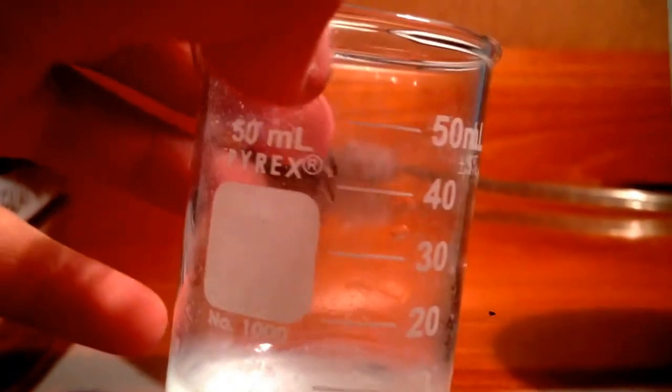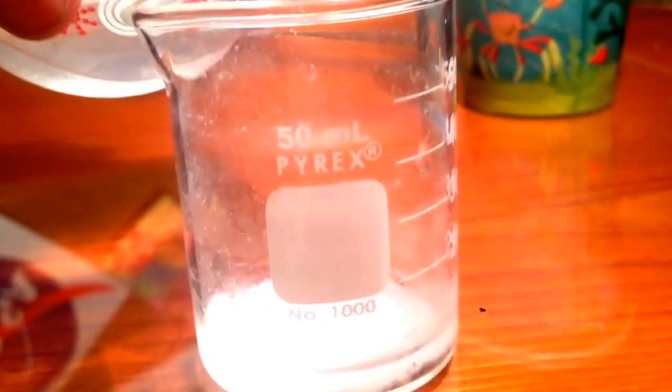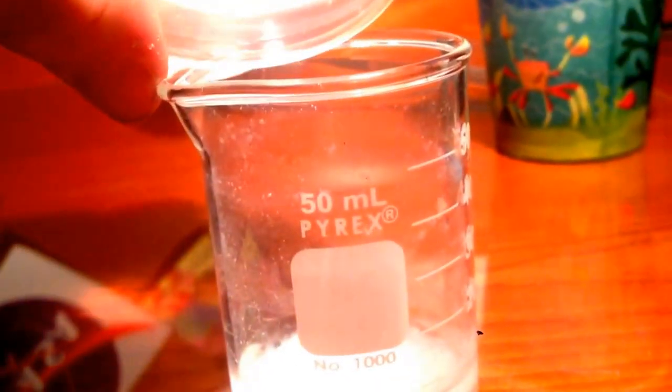I believe I'm going to add some white distilled vinegar — or 5% acetic acid — to the solution, and try to dissolve as much zinc oxide as I can. It won't dissolve copper. So to the beaker, I added 5% acetic acid.